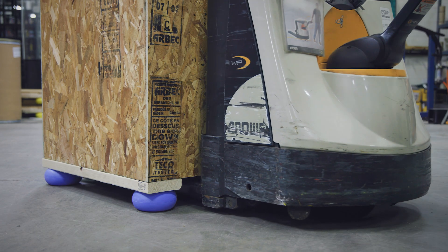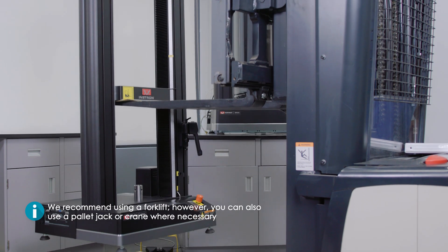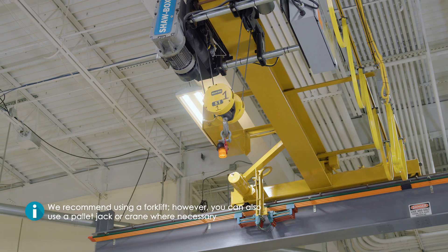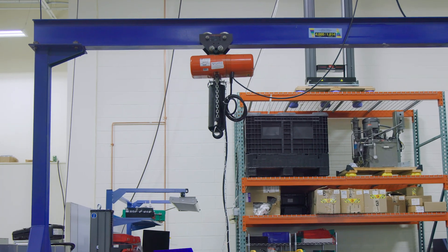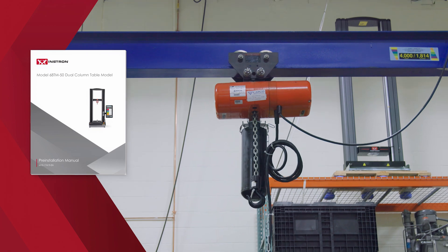When moving a testing system from your receiving area or within the lab, we recommend using a forklift. However, you can also use a pallet jack or crane where necessary. If you only have access to a crane, please reference the pre-installation manual for guidance.